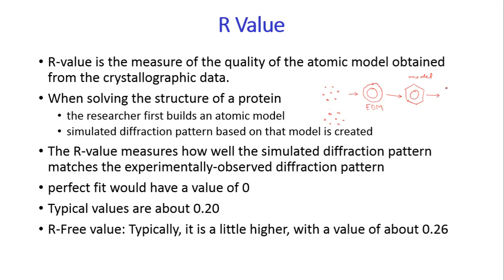From this model you computationally predict what diffraction pattern I might get if I give this structure to any X-ray crystallography machine. Then this diffraction pattern is compared to the experimental diffraction pattern, and this is called the predicted diffraction pattern.